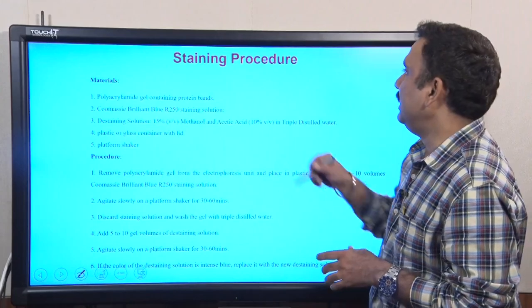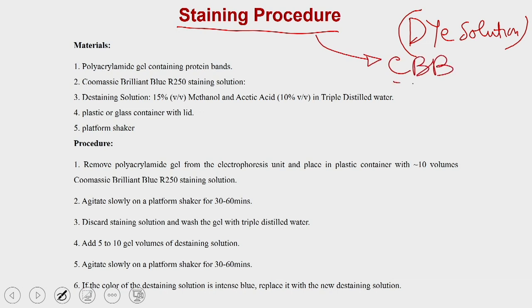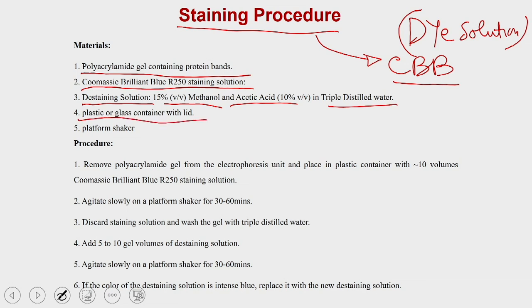Now, in a standard staining procedure, you have a dye solution which can be used to stain the gel. To explain the staining procedure, we have taken staining with Coomassie Brilliant Blue. For that, you need a PAGE gel which contains protein bands, a Coomassie Brilliant Blue R250 stain solution, and a destaining solution. The destaining solution is methanol, acetic acid, and water. And then you need a plastic or glass container with a lid, and a shaking platform.